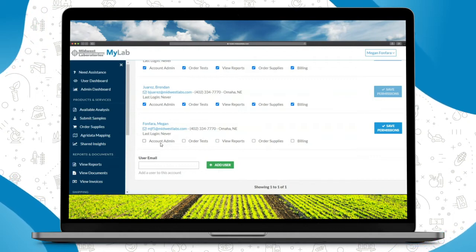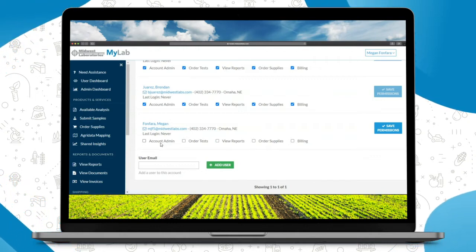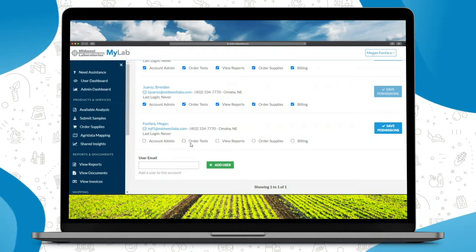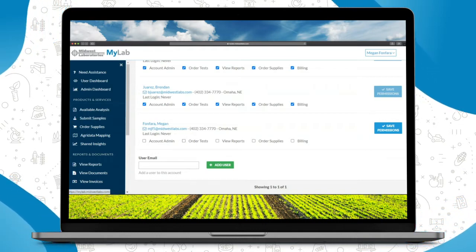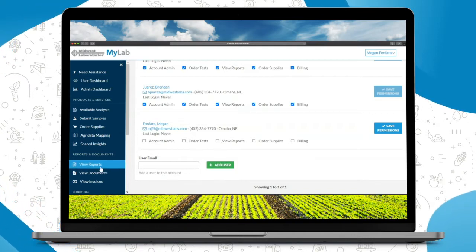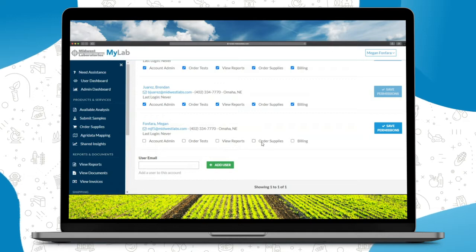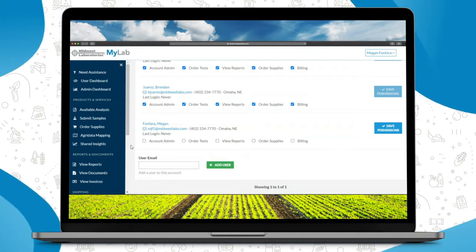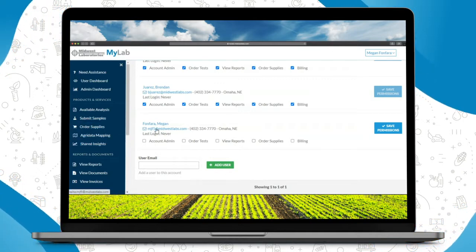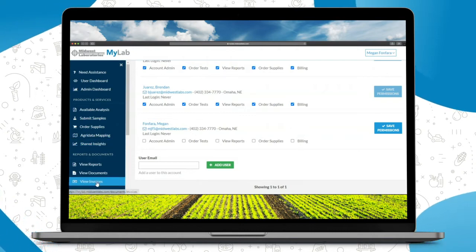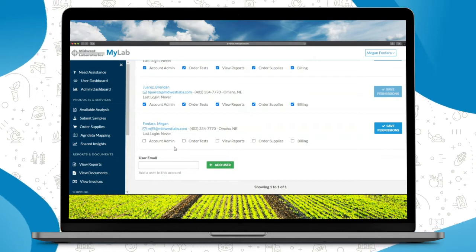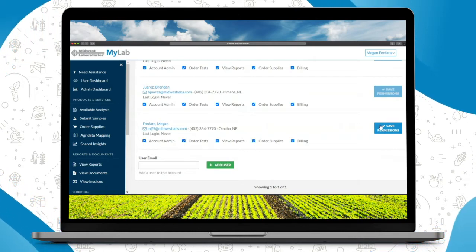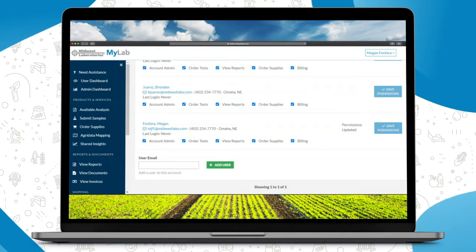Account admin is full access to everything that you normally see here in the account. Order test is to submit that sample paperwork under submit samples. View reports is to go in and view those reports. Order supplies is going in and ordering supplies, which I'll show you in a moment. And then of course billing, which is where you can view your invoices and pay, which I will also show you here shortly. Once you select their permissions you'll hit save permissions.